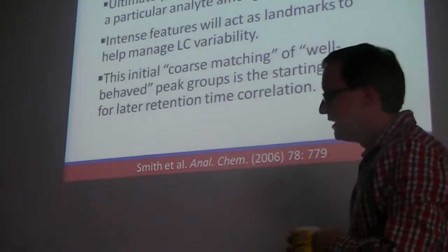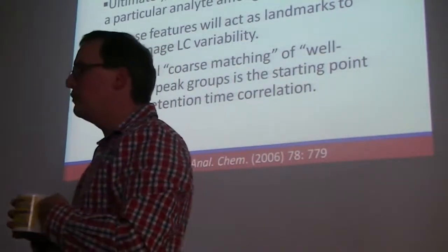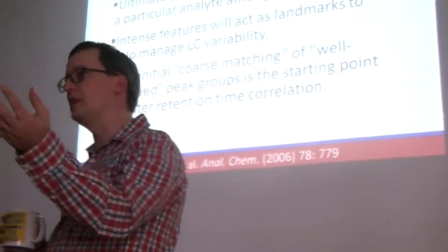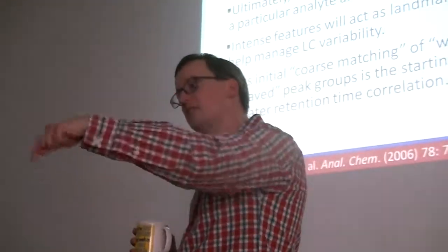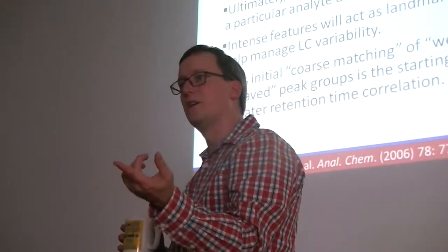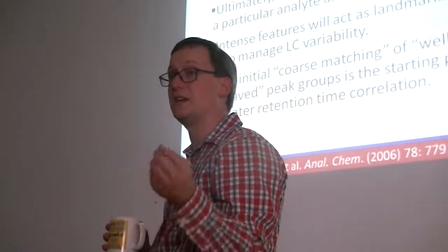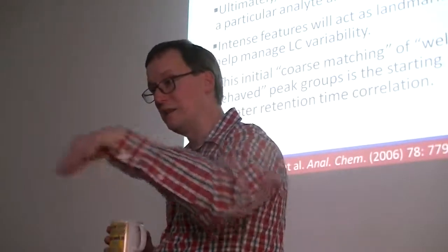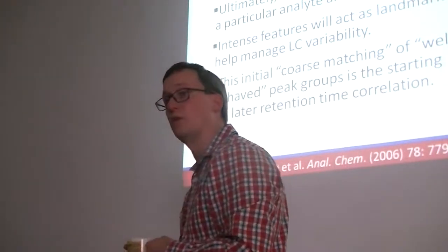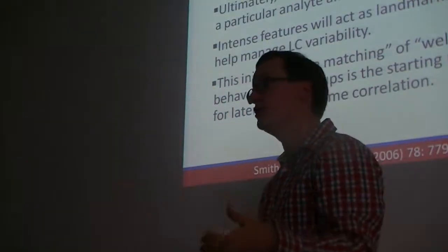All right. Now, why do we need to bother going further than this? You know, if we can look in an individual LCMS experiment and say these ions are the ones that we care about, we're done, right? Generally speaking, we like to do comparisons. We like to be able to say these are examples of 5 replicates of this cohort, and these are 5 replicates of that cohort. So what differentiates these 2 cohorts?